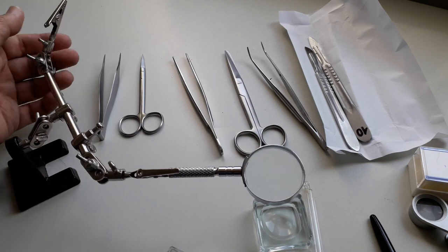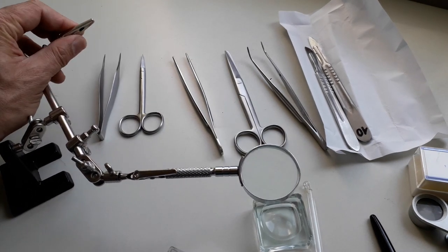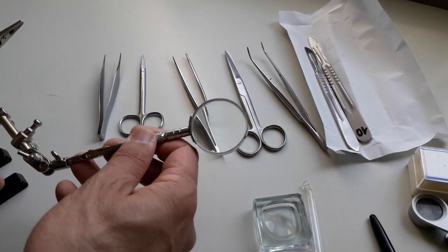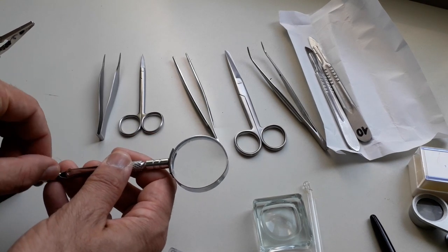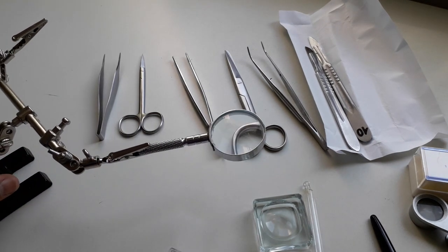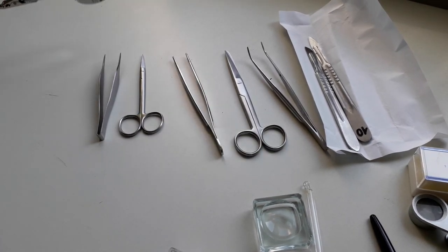This is actually used for soldering, for holding electronic components together so that you can solder them together. But I'm using it to hold a little magnifying glass when I want to dissect or take apart very small specimens, insects and so on. This is quite useful. I'm not using it so often, but it's good to have it around. So I'm going to get it out of the way.